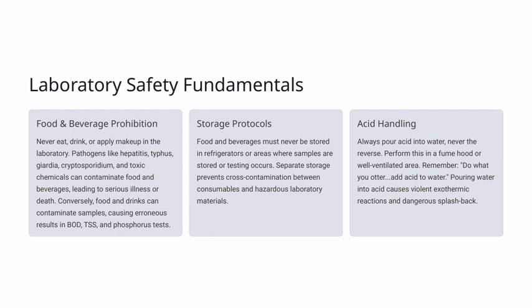Finally, a quick note on acid handling. When working with acids, always pour acid into water, never the other way around. This might sound simple, but it's a critical safety rule. Do this in a fume hood or a well-ventilated area. Think of the phrase, "Do what you otter." Add acid to water. Pouring water into acid can cause violent, exothermic reactions and dangerous splashes, so always remember to add acid to water carefully and cautiously. These safety fundamentals are the backbone of a safe and effective laboratory environment, and they connect directly to our overall goal of conducting accurate tests while protecting everyone here.